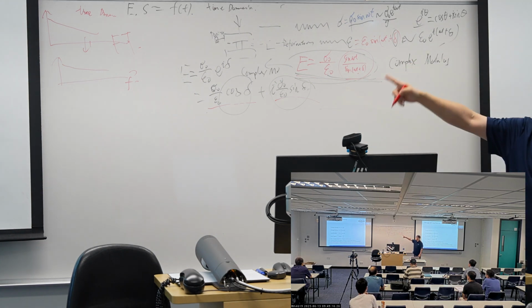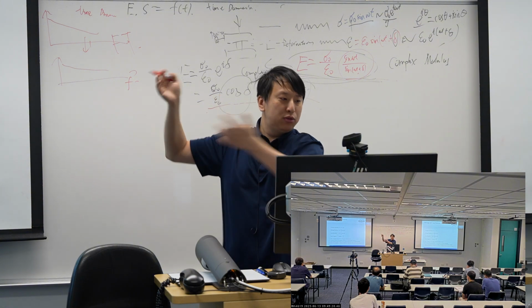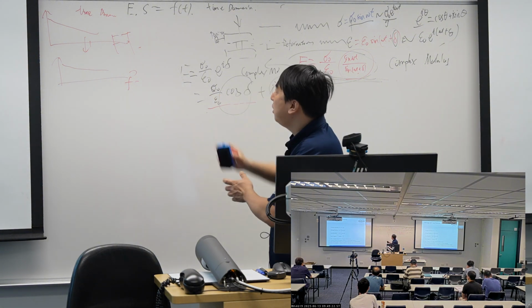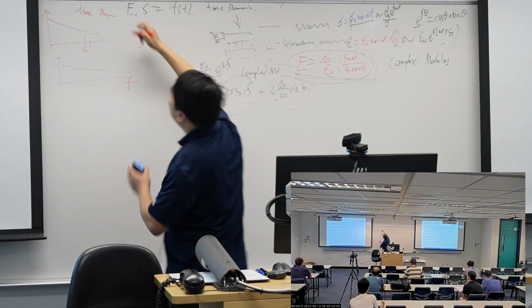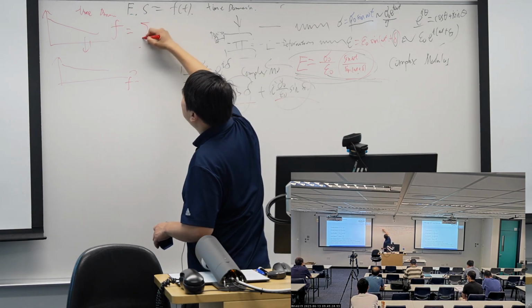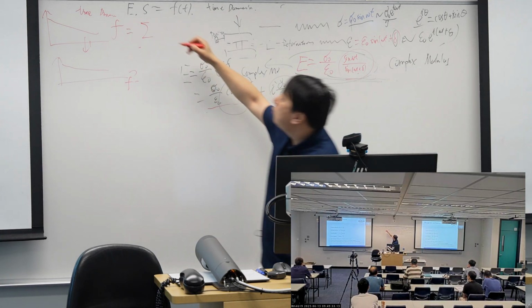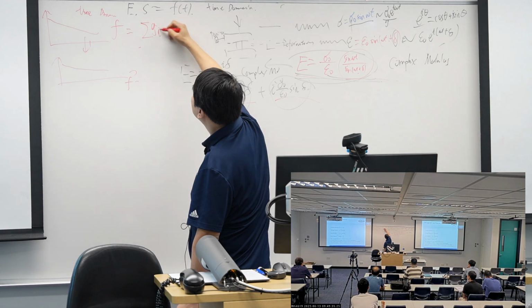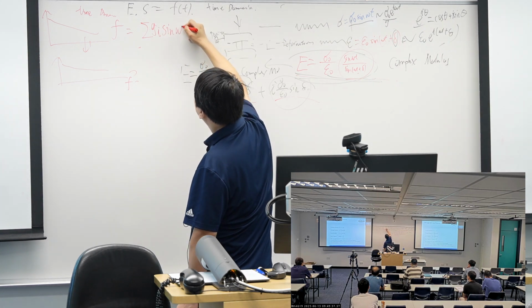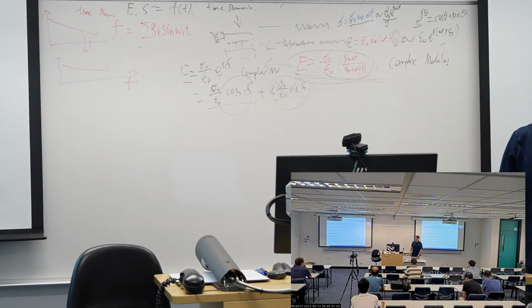And for the Fourier transformation, we change the time domain stuff, how we do that in mathematics. A function, we change it to a summation of a series of different frequencies, right?